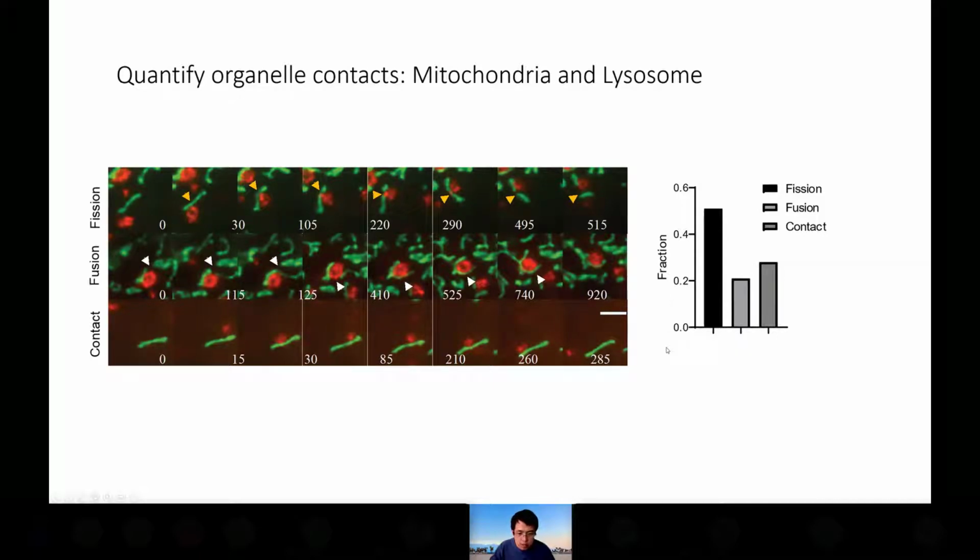I want to emphasize that this quantification and tracking of organelle movement in the live cell, with this kind of resolution, is difficult in the raw data set for such a long-term acquisition window.